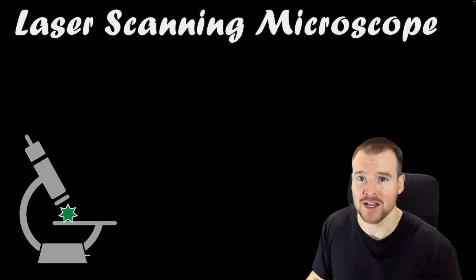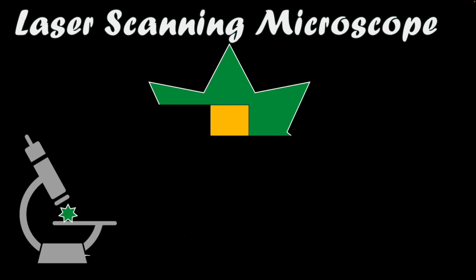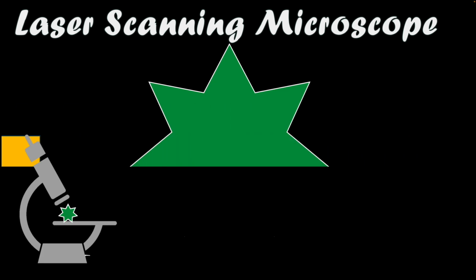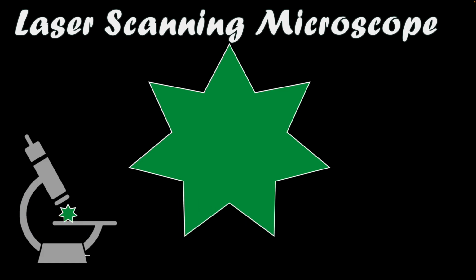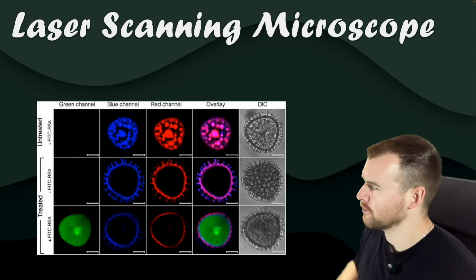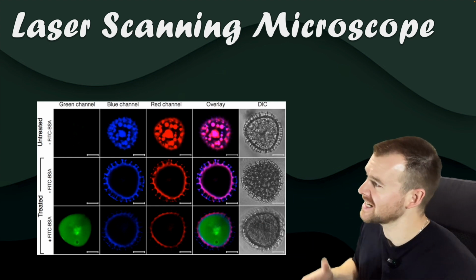So I have a bit of an animation here. I'll pop out of the way. So it's going to scan the image. We see the top part here, then a little bit further down, a little bit further down. It's going at different depths to try and build up a 3D picture of this image. So here's some pictures that I found from Google for what that kind of looks like, finding the different layers and then putting them all together.